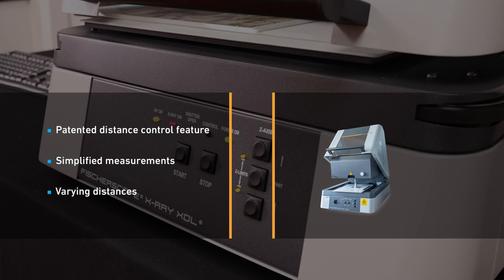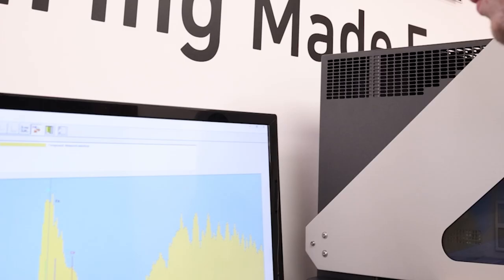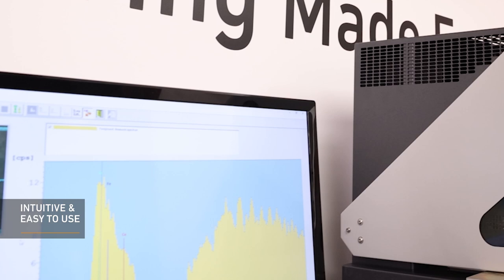Optical focusing is quick and easy for complex-shaped samples, and a specialized safety system prevents contact between the sample and the detector.